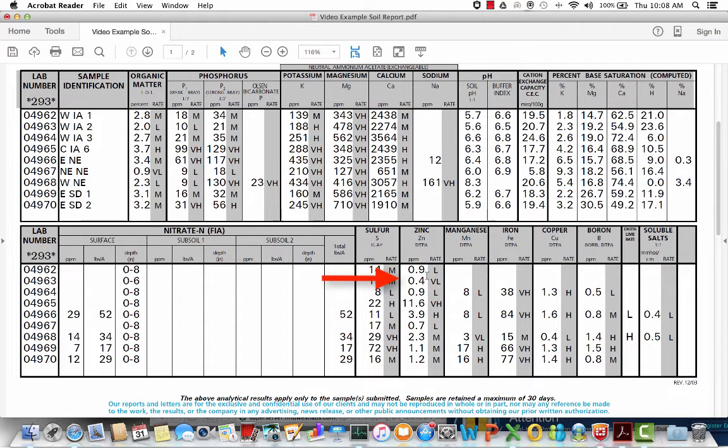One thing I would bring your attention to is sample number 2 here from western Iowa. We've got very low phosphorus values at 10 parts per million and very low zinc values at only 0.4 parts per million. Sometimes in some soils and with some crops, this interaction between phosphorus and zinc could actually drive a zinc deficiency. If you were to make a very large phosphorus application, which this 10 parts per million is going to be calling for, and did not make any zinc application, you might push a zinc deficiency into that crop where normally it might have just enough to get by. In this case, with putting that very high amount of phosphorus down, you might push that deficiency in the plant.